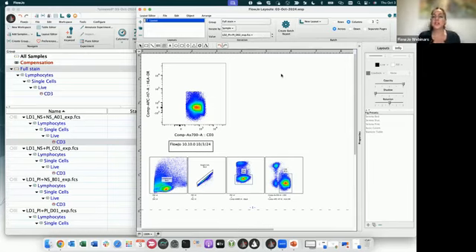So what are the conditions to have a template that is working well and functioning? For sure, having the same staining panel, and a group with a group-owned gating strategy. The group must be live, especially if you select some characteristics for the file name or samples to be included in this group. And that's pretty much it.